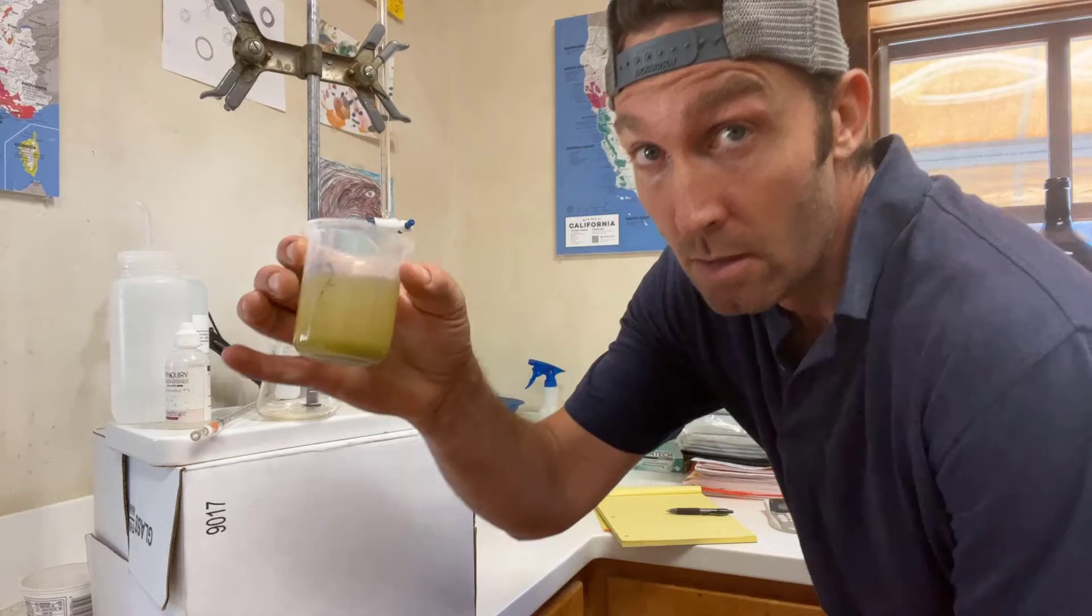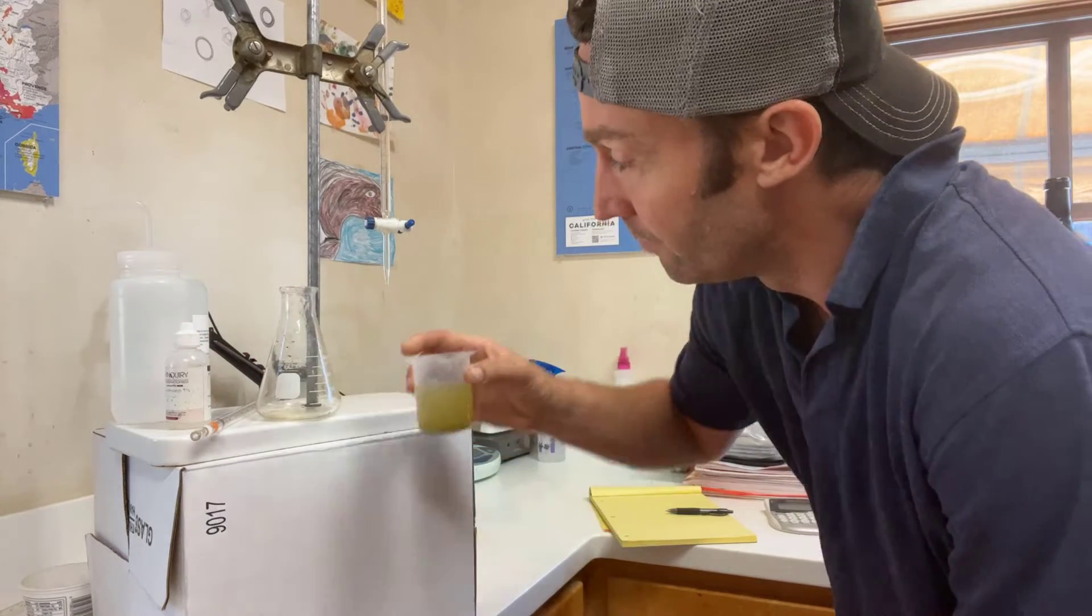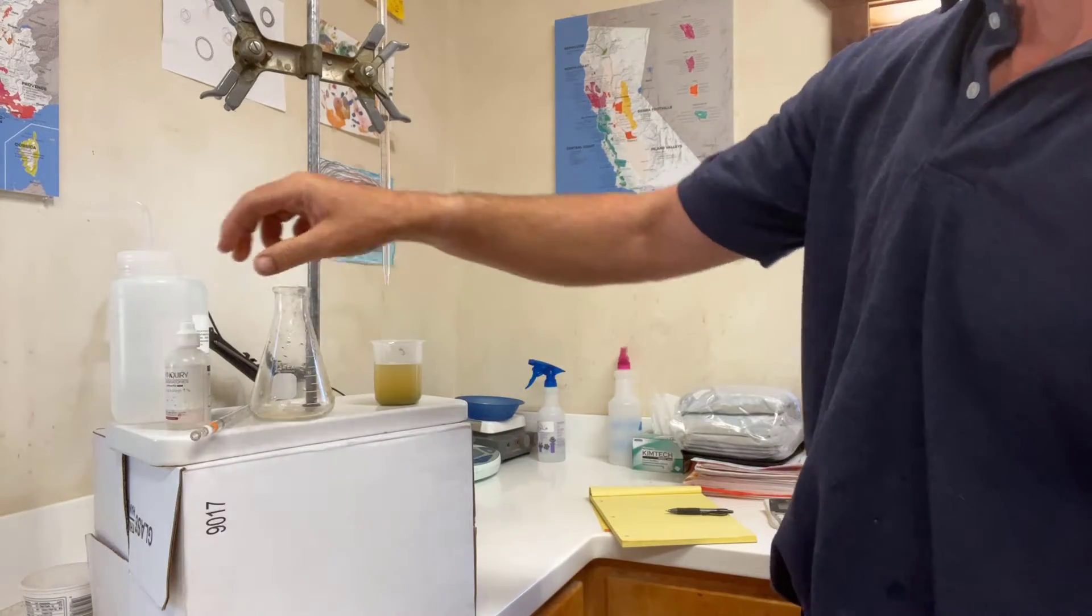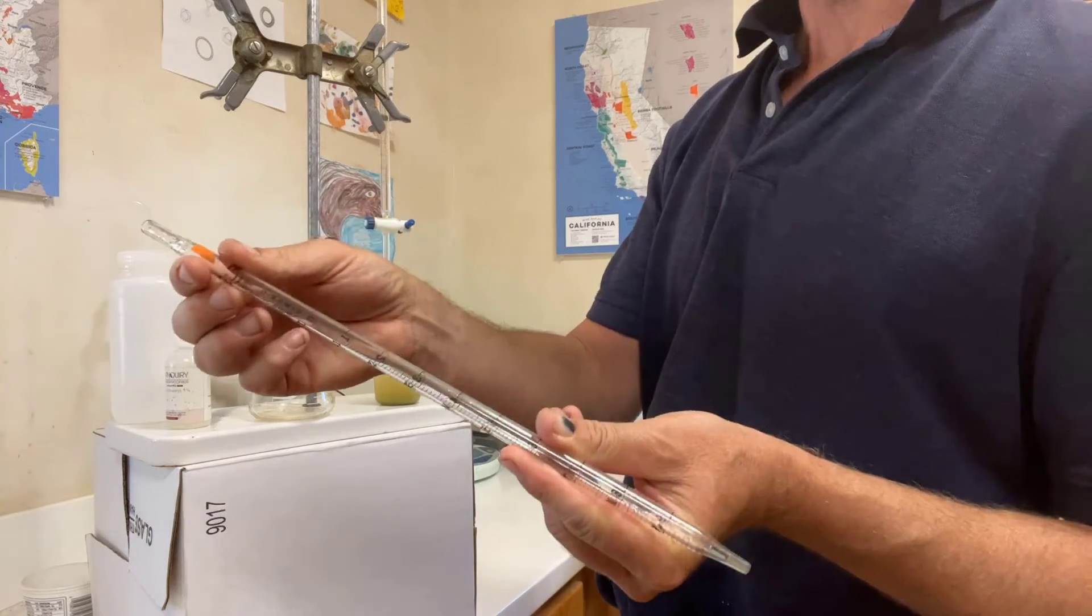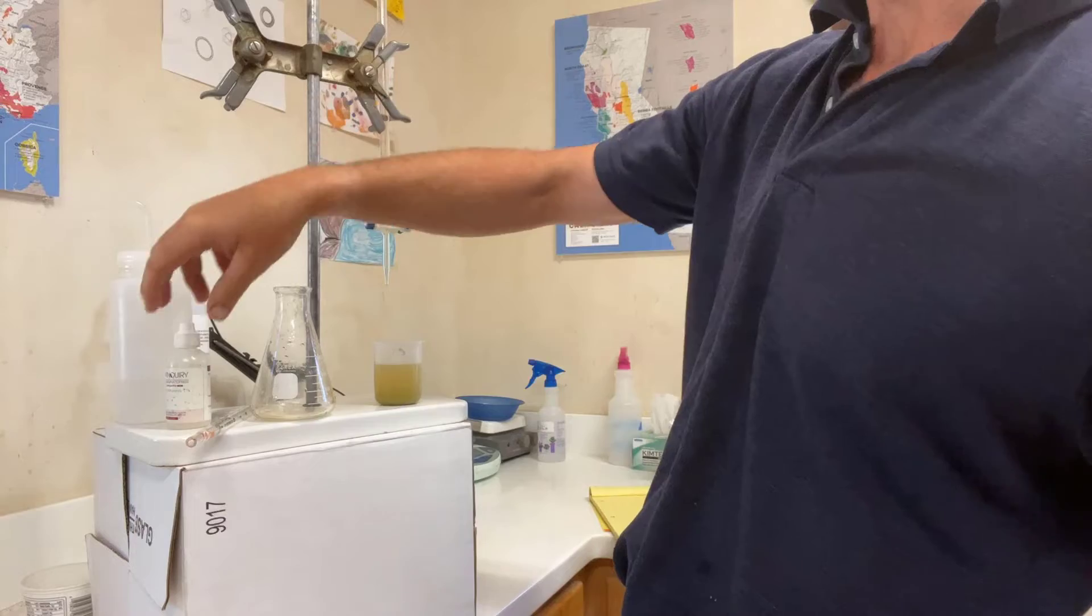So I've got a juice sample. This is chardonnay juice, not very ripe. TA is gonna be quite high. A little flask. Got a pipette to accurately deliver five milliliters. It's important that this is quantitative so the calculations work in the end.